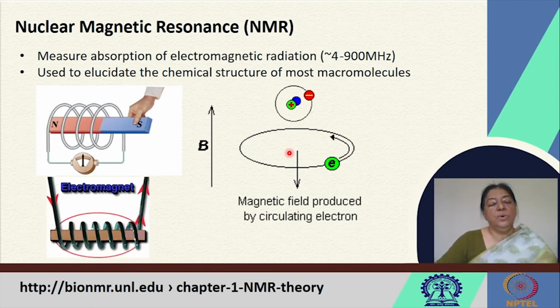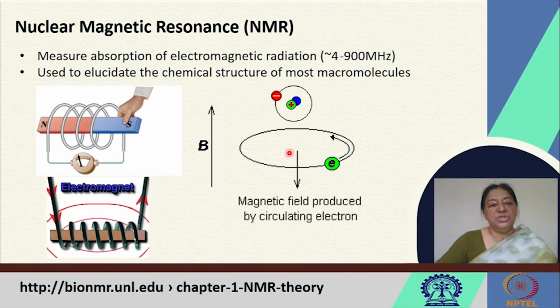And later on, we will also look at the variations in the spectrum due to ligand interactions with the protein.